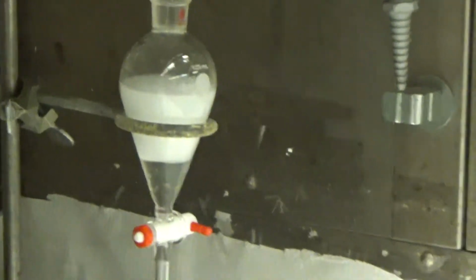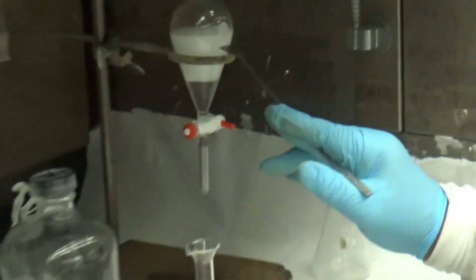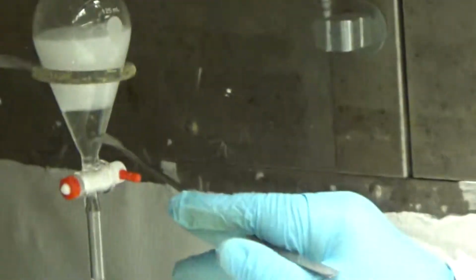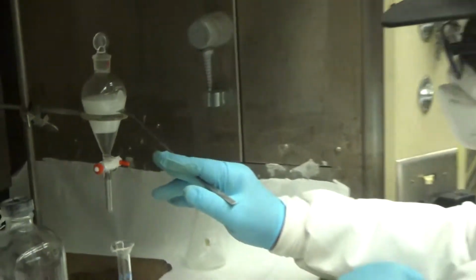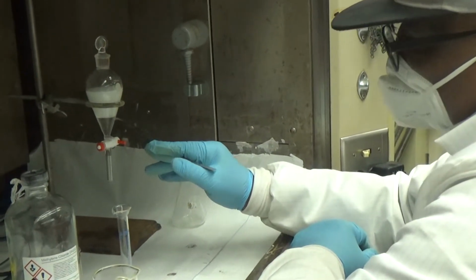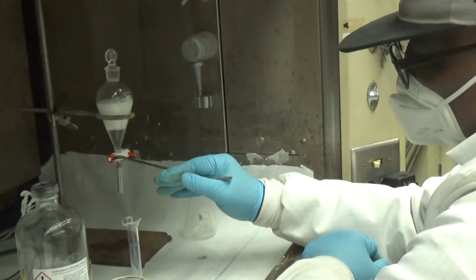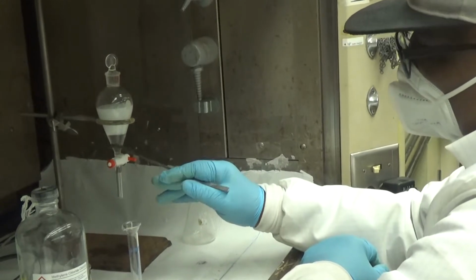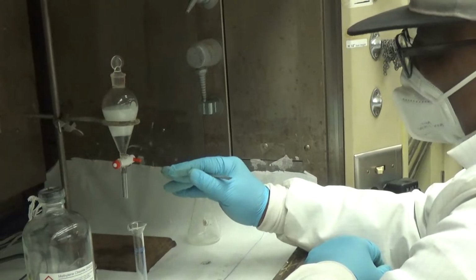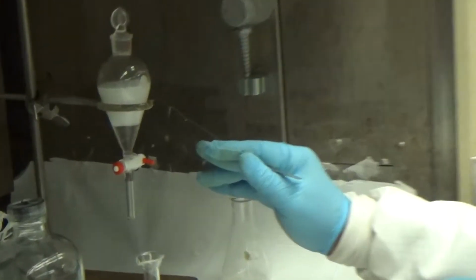So now you have here 2 layers. You have the top layer and the bottom layer. To know which layer is the top layer and which is the bottom layer, you need to know the density of the 2 compounds. In this case, you see that the organic layer, which is basically the methylene chloride layer, is the bottom layer. And the top layer is the aqueous layer.